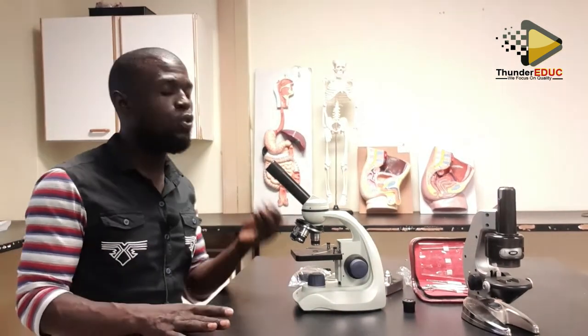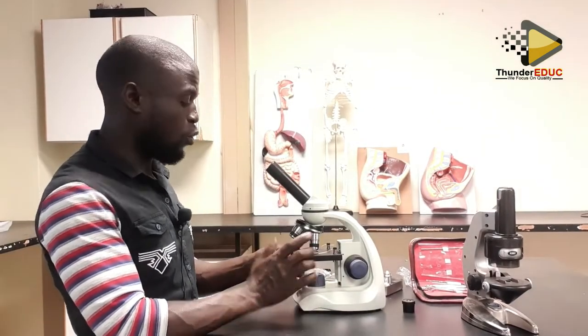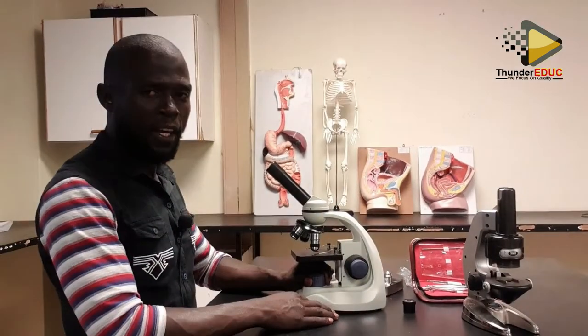But if it is not that thick, it's a little bit light, for example when you're viewing an onion cell, in most cases you use a small amount of light. And when you're using a low magnification, in most cases we use the big hole. When you use a high magnification, it means that you are focusing on a very small part of the object you are trying to view. It means that the magnification is big. So you turn it, and as you turn it, you will see how much light is entering the eye.